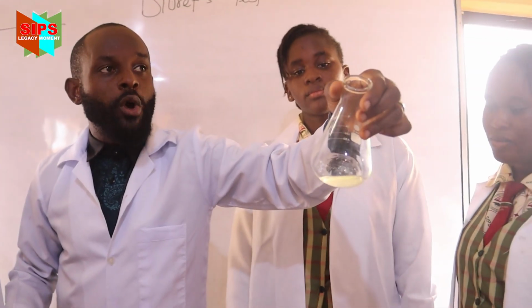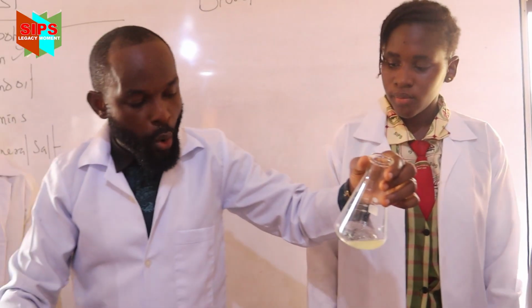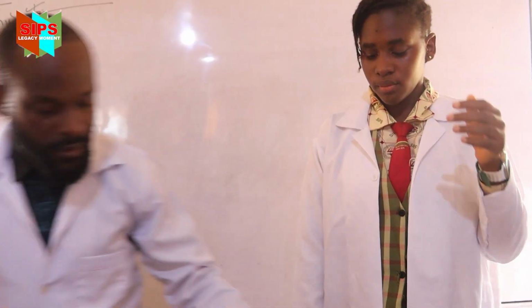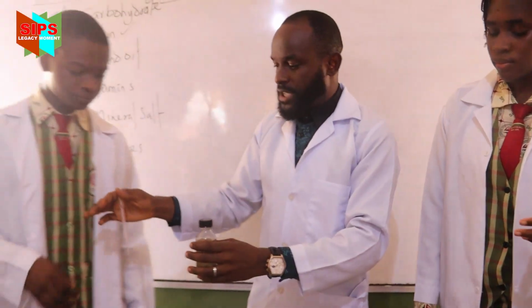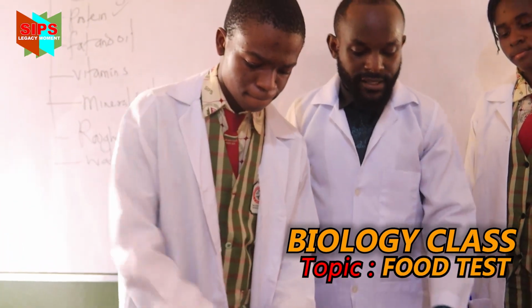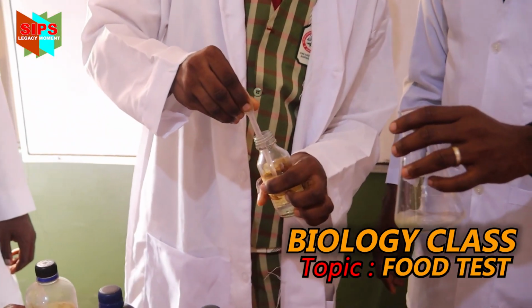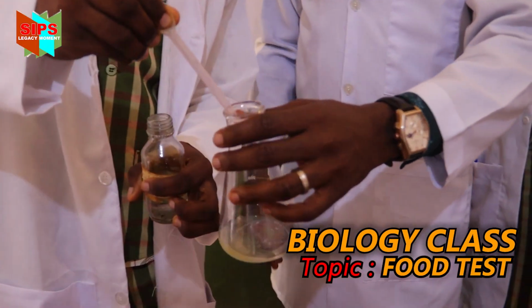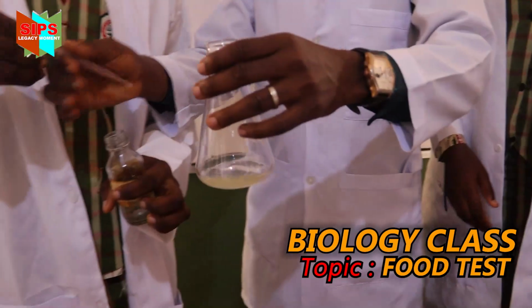Now, the next thing we are supposed to add is sodium hydroxide. What are we to add? Sodium hydroxide. Please go ahead. He adds sodium hydroxide. You can add to it. Then shake. Just be careful how much you do the shaking.